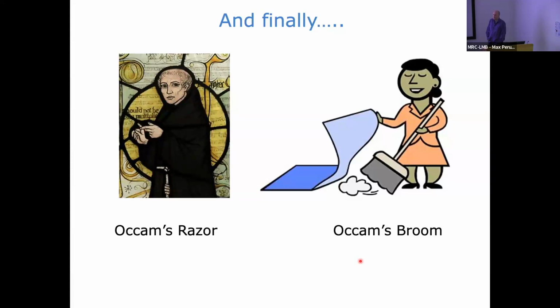Well, if some things are say 2 or 3-fold different, that's not really that significant in terms of binding constant, because the energy is in log or ln form. That's not much difference in the amount of energy that's actually happening. So that could just be the assumptions you've made in that technique, or maybe your concentrations are not as exact as you expect. So you can get that variation. I think you just quote things and say by ITC it was this, and when we repeated it by this we got that. So this correlates with this by that, because if something was like 2.5 and it was 5 by ITC, then that's kind of your variation.